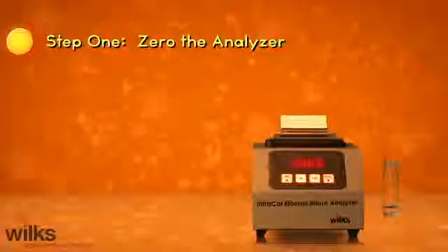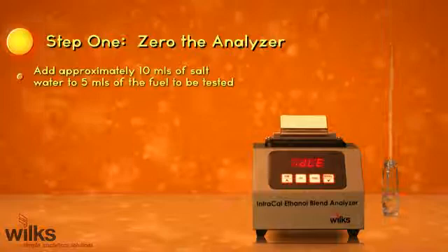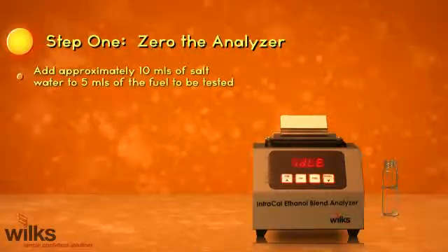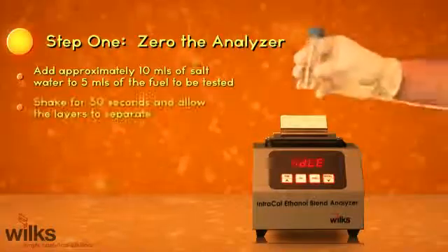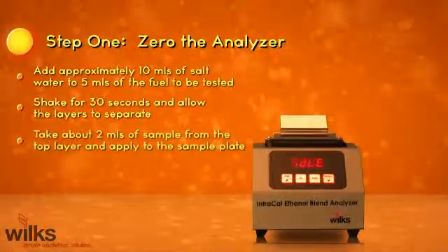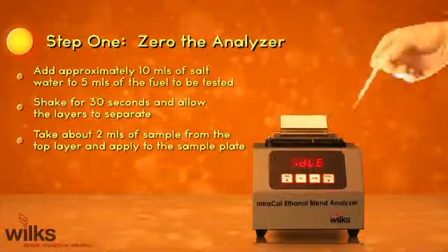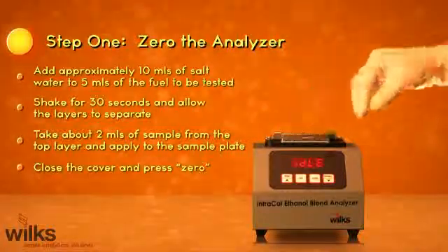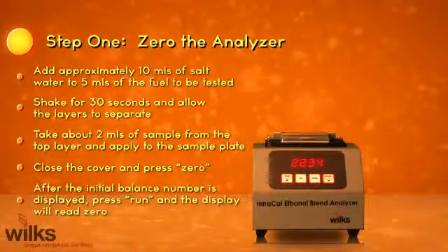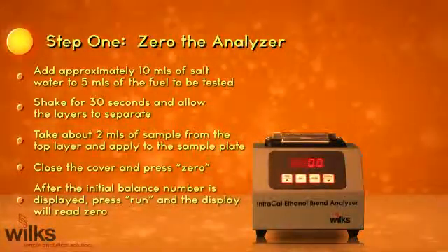Step 1: Zero the analyzer. Add approximately 10 milliliters of salt water to 5 milliliters of the fuel to be tested. Shake for 30 seconds and allow the layers to separate. Take about 2 milliliters of sample from the top layer and apply to the sample plate. Close the cover and press zero. After the initial balance number is displayed, press run and the display will read zero.